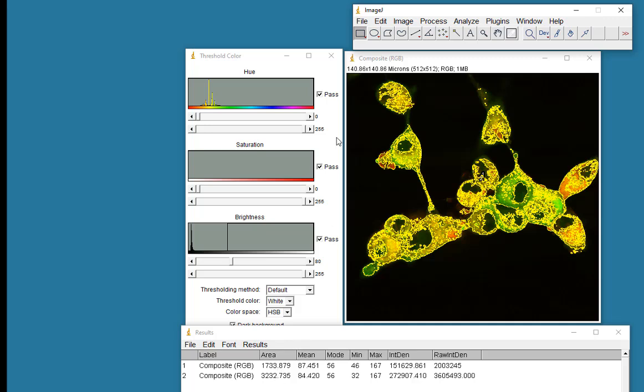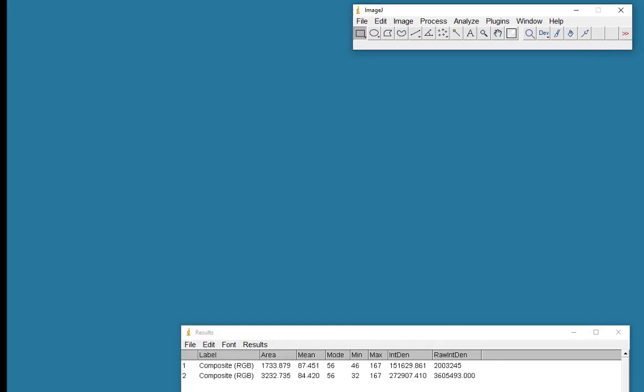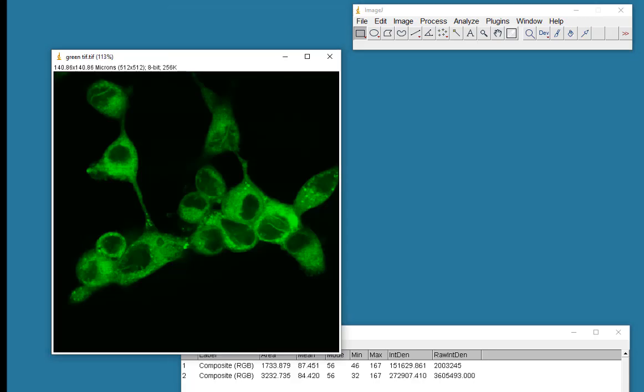This is not really an ideal way to do colocalization. It's better to use a correlation analysis, and that's what I want to show you next. So I'll get rid of that, I'll get rid of the composite image, and I'll bring back my red and green images.